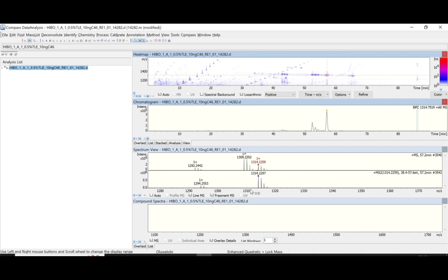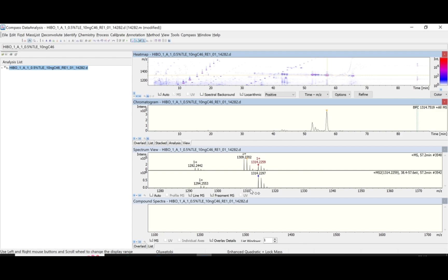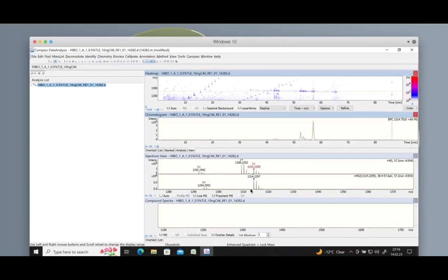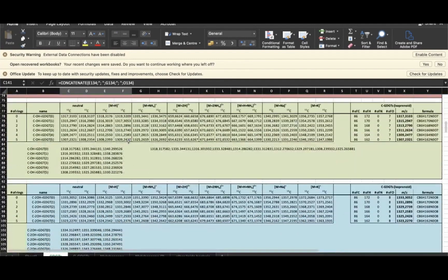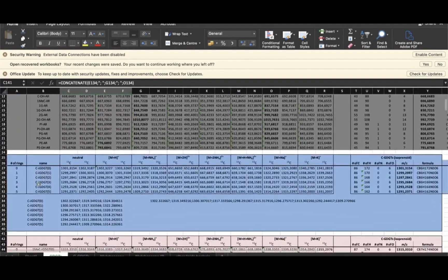What is left is to compare these masses with the standard mass list, which you can always get from your laboratory. We are looking at core GDGTs. The masses we are looking at are 1292.24, 1309.27, and 1314.22. Once you are able to confirm the first four numbers and the first two numbers after the decimal point, you are good to go.